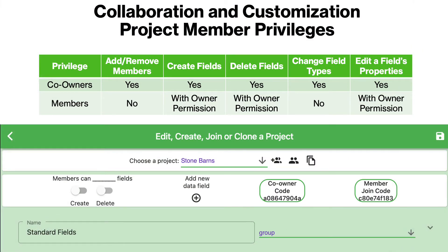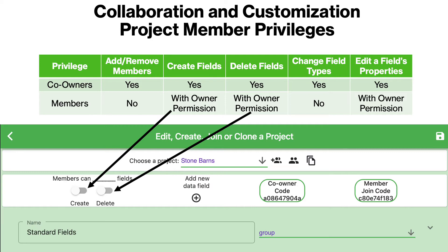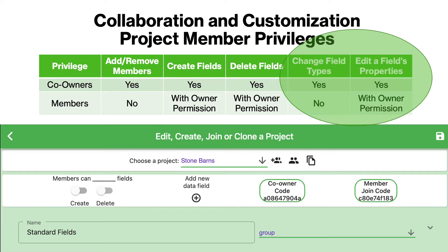Let's discuss what owners and members can and can't do with setting up a project. Owners can do everything, as you can see on the table at the top. They can add and remove members, create project fields, delete fields, change the type of a field, and edit a field's properties. The ability for members to add or delete fields is controlled by the two switches marked by the arrows. The last two items correspond to permissions for each field in the project. Next we should discuss what adding and customizing a project field looks like.